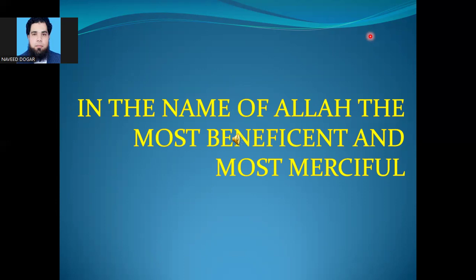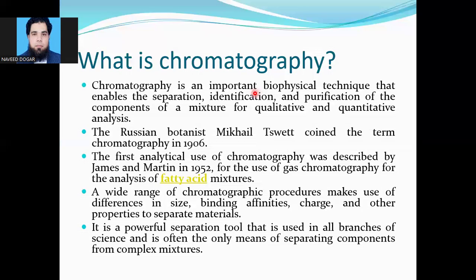And today I will discuss the basic principle and types of a very good analytical technique, which is called chromatography. This topic is important with respect to various experimental work as well as in analytical chemistry or in other branches of science. First of all, we will discuss the introduction of chromatography.